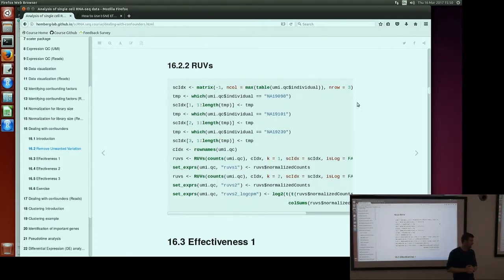And this is where it gets tricky, because in identifying the cell types, you're using the information about differences between the cells from the same data set. And if you then try to use them as replicates, it's like double dipping in the data. This would be the same sort of problem as if we said, okay, we'll identify cell types and then look for differentially expressed genes between these cell types that we've defined from the data, because by definition, we wouldn't have identified those cell types if there weren't differences in expression between these cells.